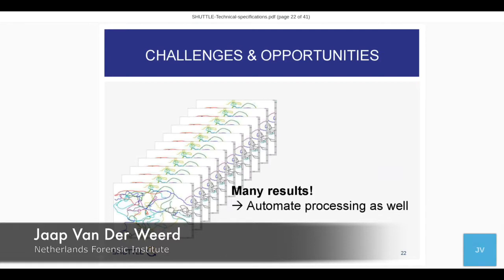We don't look through the microscope, but we acquire images, and somebody has to sit at a screen, at a computer, look through all these images and say, here's an interesting trace, this is what I want to consider next. And of course, then you introduce the subjectivity again at the next level. So you don't want that.